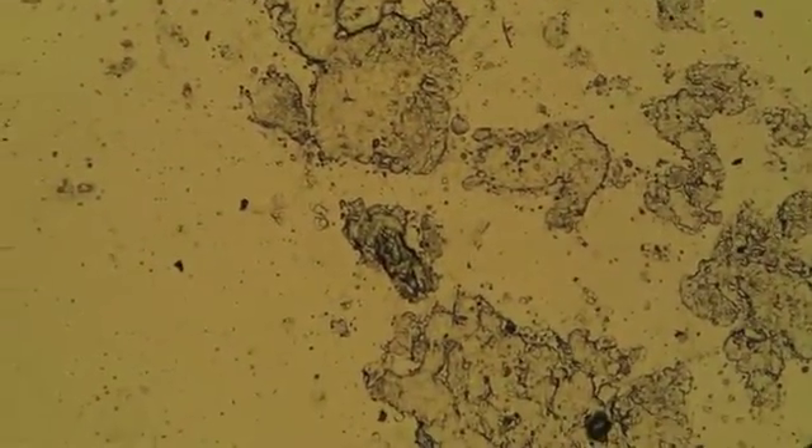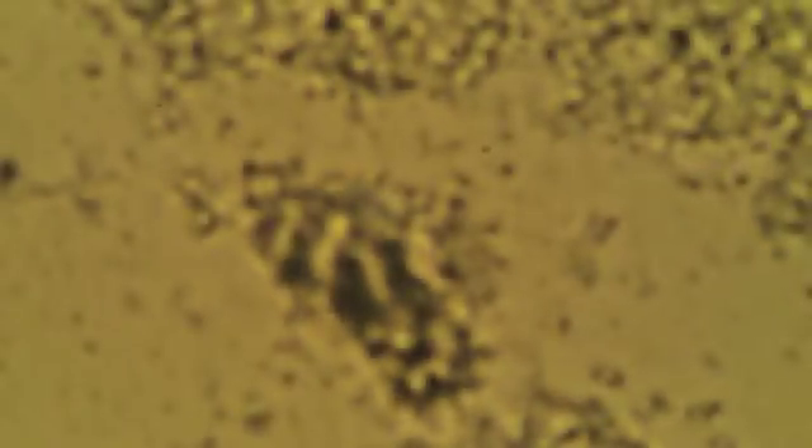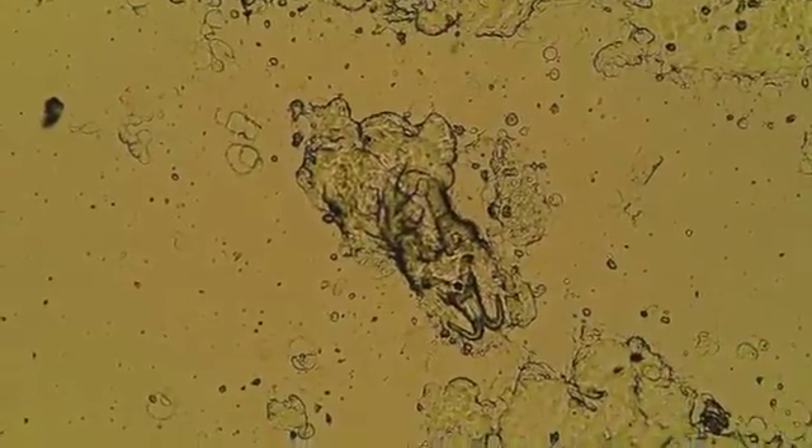Here you can actually see another one coming up in the centre of the screen. They're sort of like a fluke shape — that's what you try and look for when you put these under the microscope. You're also looking for the large haptors.